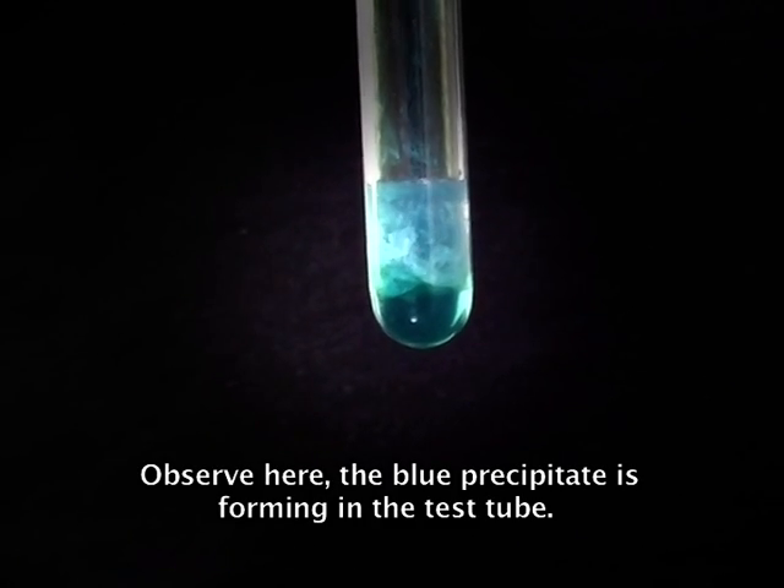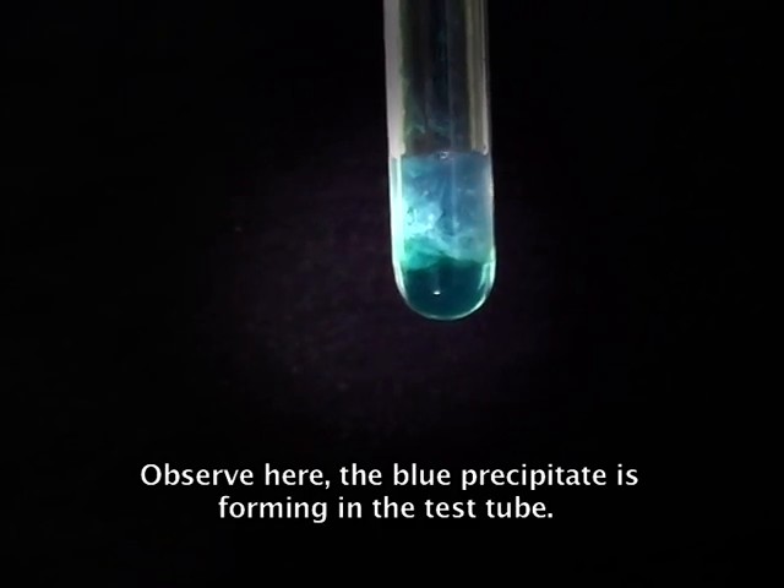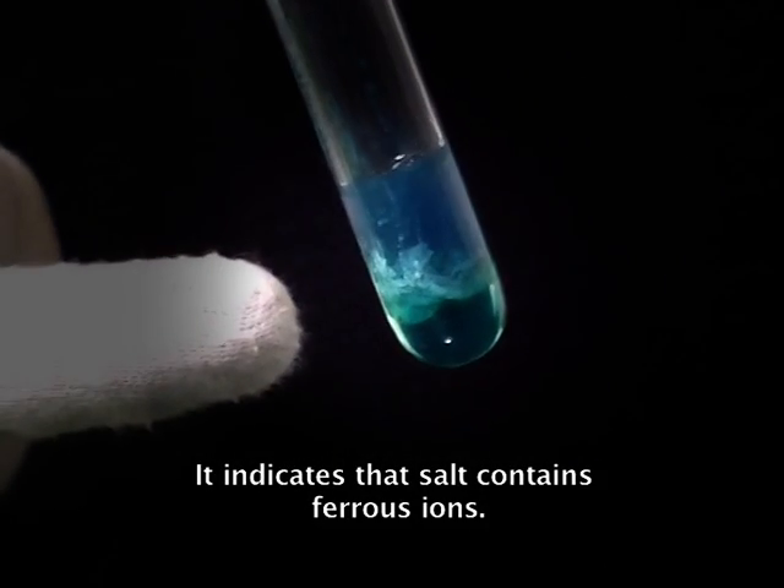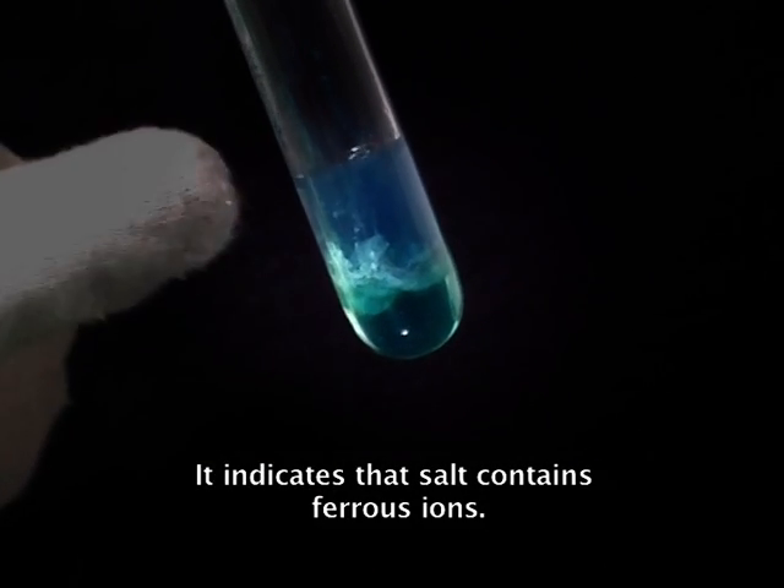Observe here — the blue precipitate is forming in the test tube. It indicates that the salt contains ferrous ions.